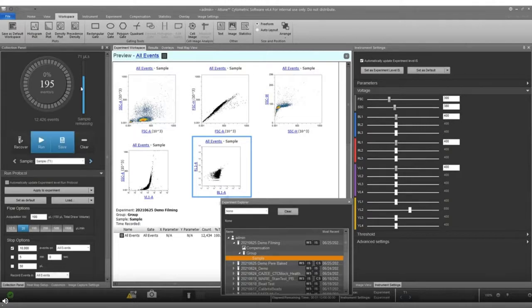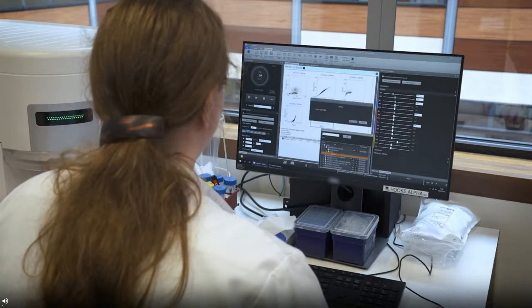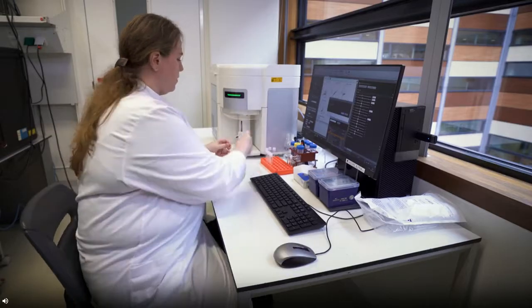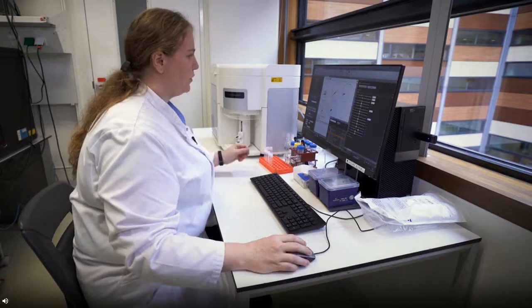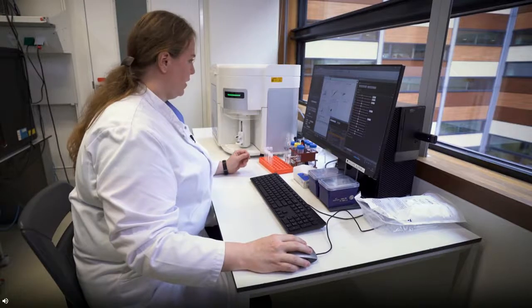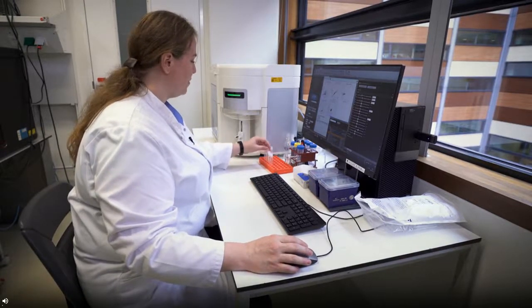This is a syringe-driven system, so it has taken up 25 microliters, and I am able to recover a portion of that if I like, either into the same tube or into a different tube. I'm going to recover into the same tube. Then I get my sample back. And I am able to retain that remaining 71 microliters for the most part. There's a bit of dead volume there too.